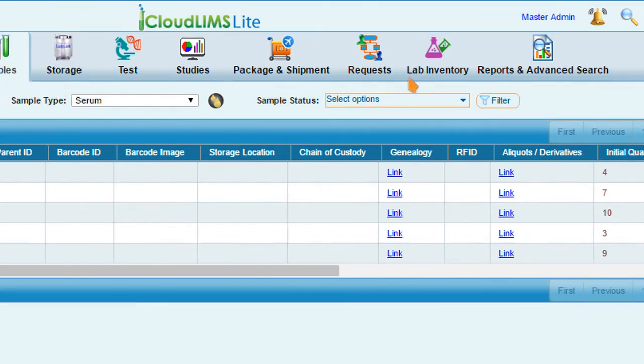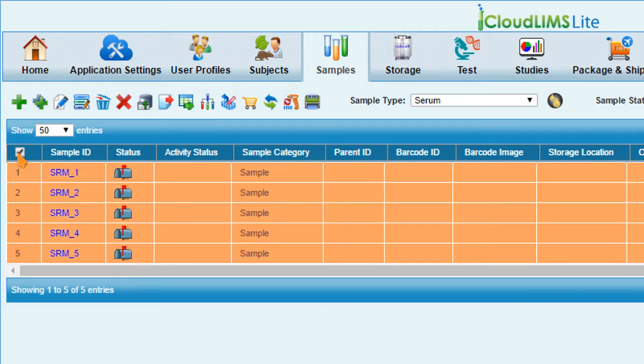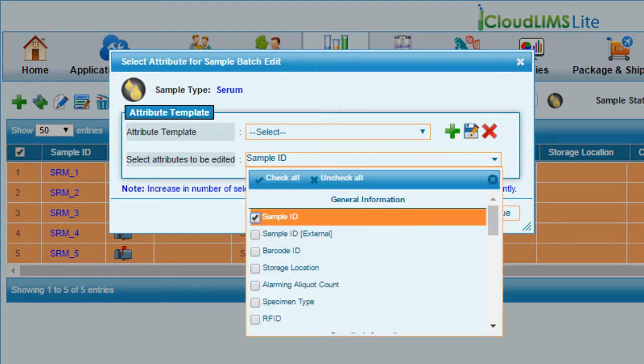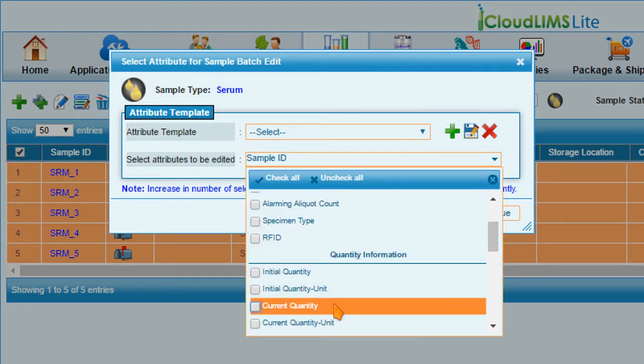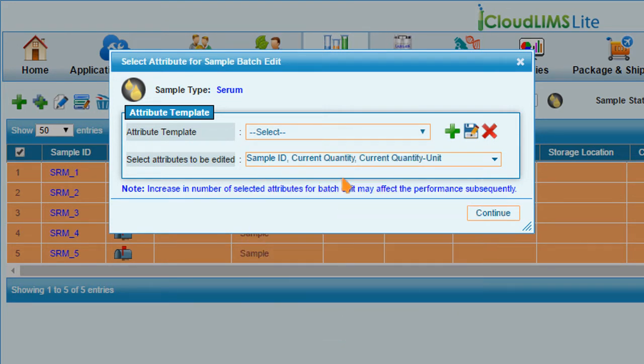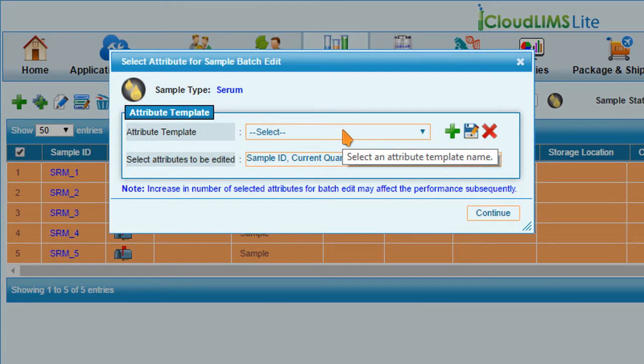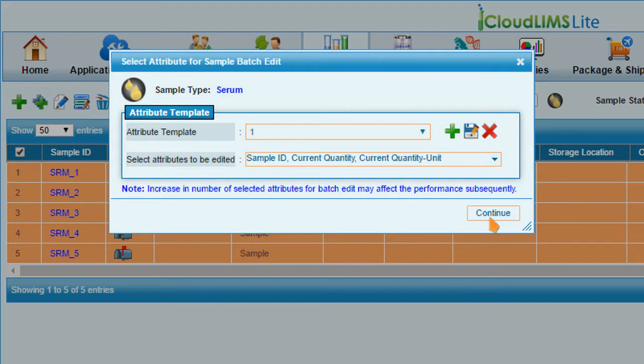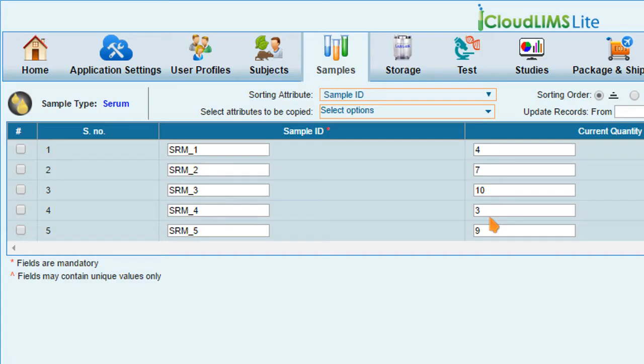To edit them, click the Batch Edit icon. Select the attributes to be edited in the drop-down. At this point, you can save the selected attributes as a template for future use. Click Continue.